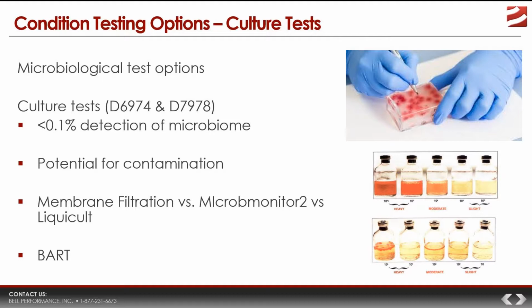So for the real world, for those of us who do not have access to a genetics lab, we have three different main options. As we discuss the different options for microbiological testing, this should illustrate an important point about how the right or the wrong test only gives us a fraction of the picture. Really, they all only give us fractions of the true situation. The question is going to be how big of a fraction we are going to get.